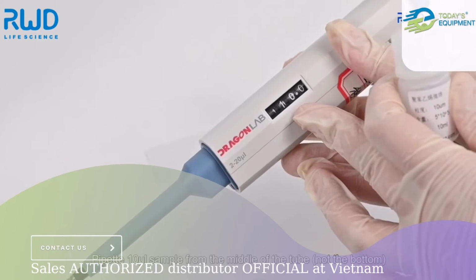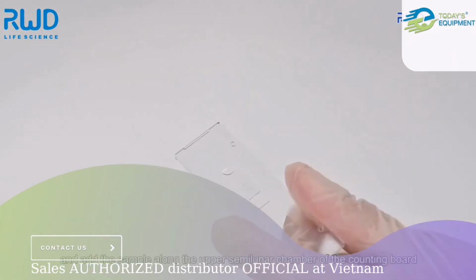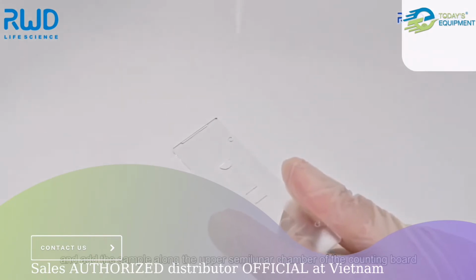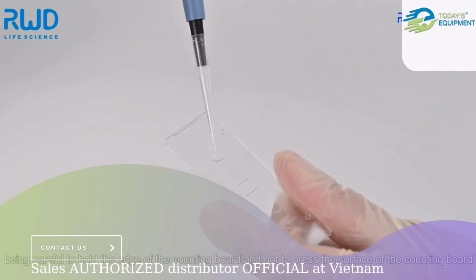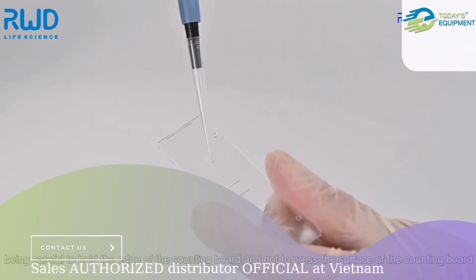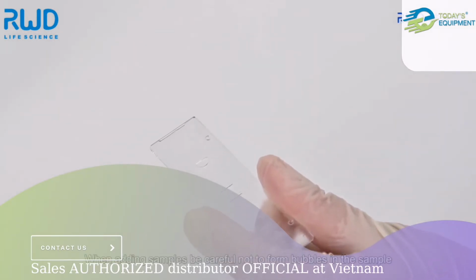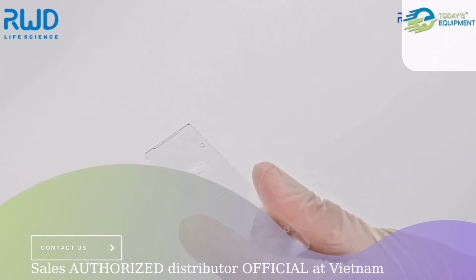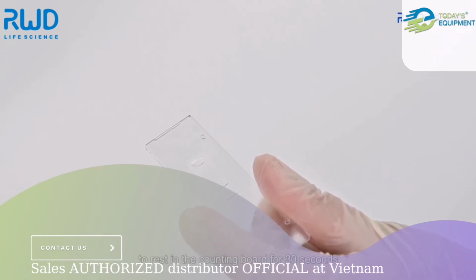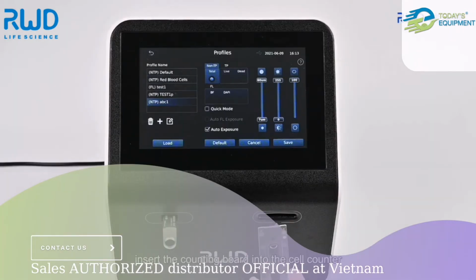Pipette 10 microliters of sample from the middle of the tube and add the sample along the upper semilunar chamber of the counting board. Be careful to hold the edge of the counting board and not to press the surface of the counting board. When adding samples, be careful not to form bubbles in the sample. After allowing the sample mixture to rest in the counting board for 30 seconds, insert the counting board into the cell counter.